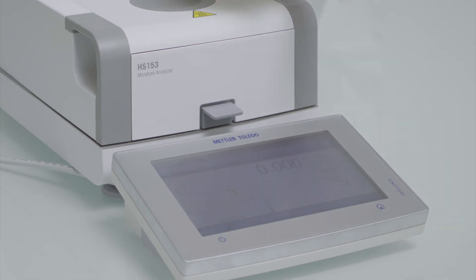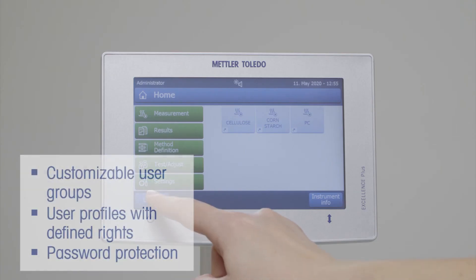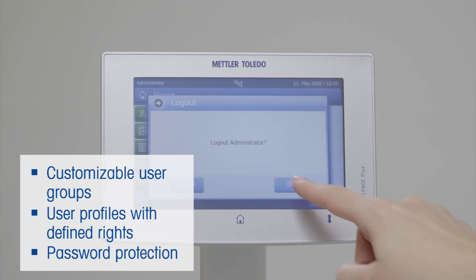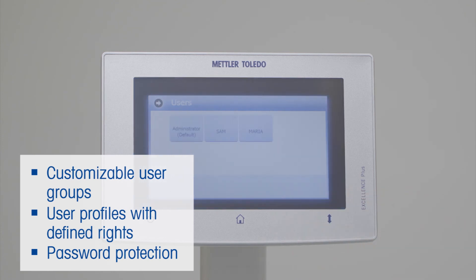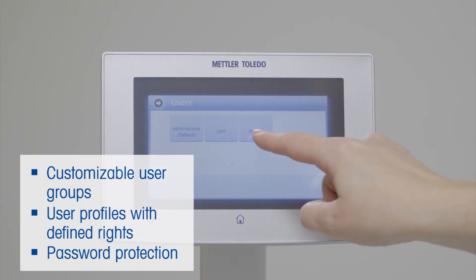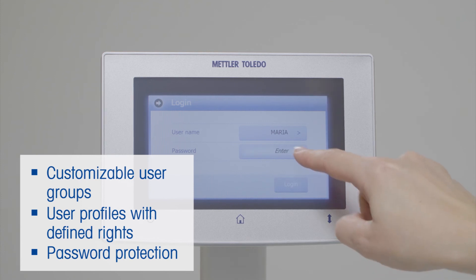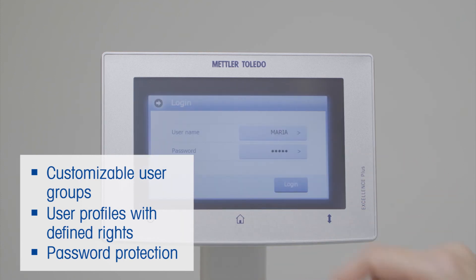If many different people are using the same instrument, it can happen quickly that settings get changed or data is deleted by accident. The moisture analyzer HX204 offers customizable user groups and user profiles with password protection for safe operation and attributable results.